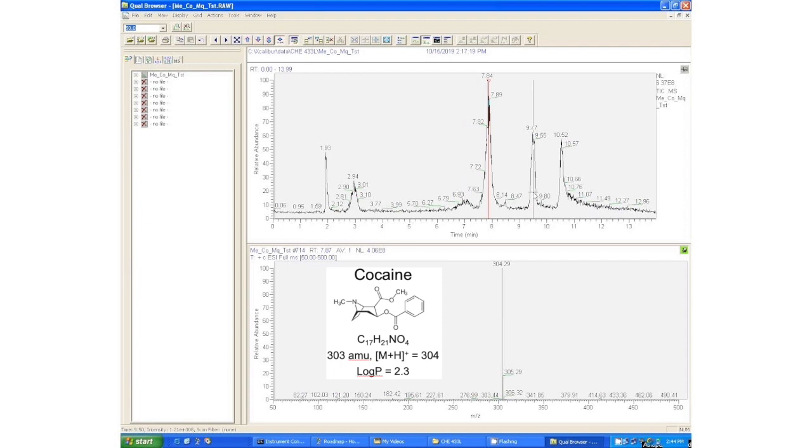So you can see here the structure for cocaine, the chemical formula, and if we take that C17H21NO4 and calculate the mass of cocaine we get 303. But because we're looking for positive ions here and we're doing electrospray, we're going to see the protonated molecule which is the mass plus an extra H+, and that's at 304. So that's what that peak is at 304, and the 305 is the isotope peak. So this is our cocaine peak.